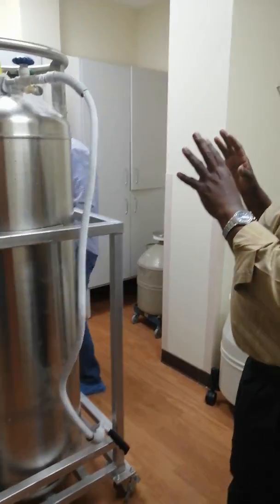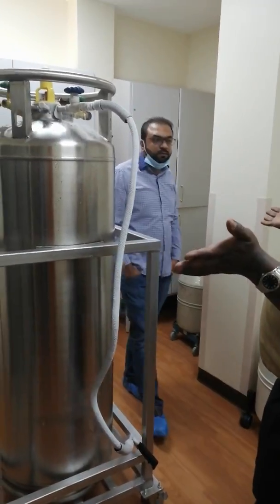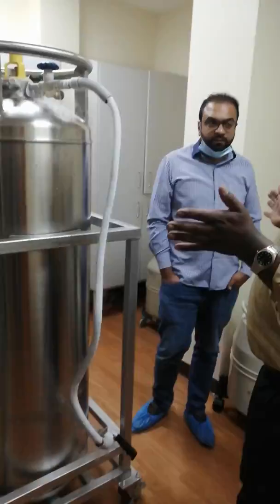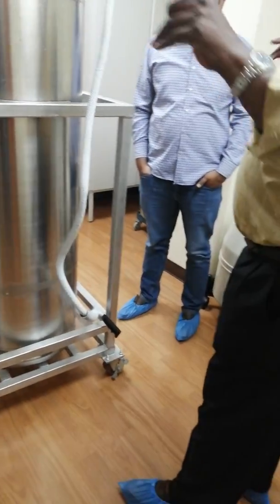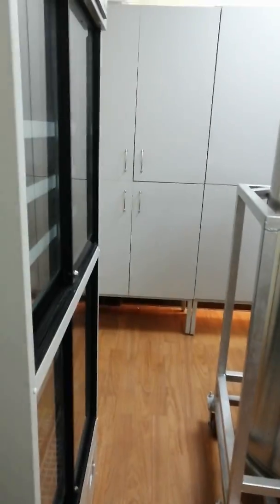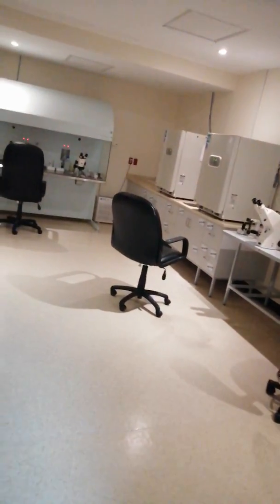If the oxygen goes all out, we will be in danger. In 10 seconds, if your brain does not have oxygen, you will die. So the monitor will give an alarm and we will escape. Okay, thank you very much.